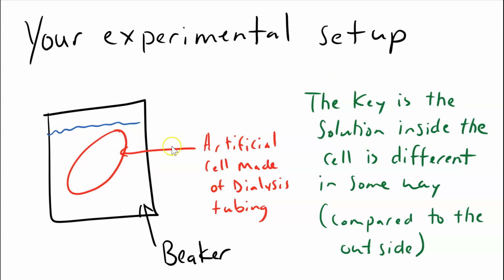The time that it'll take for this to occur is about an hour, so you can get experimental data with artificial cells in about a class period. We will construct our cells quickly at the beginning, wait an hour, and then mass them first and then wait an hour and get a mass afterwards to compare percent mass change.